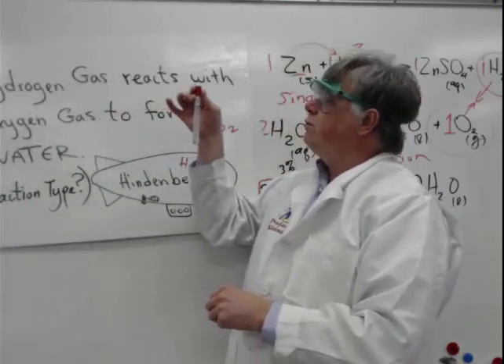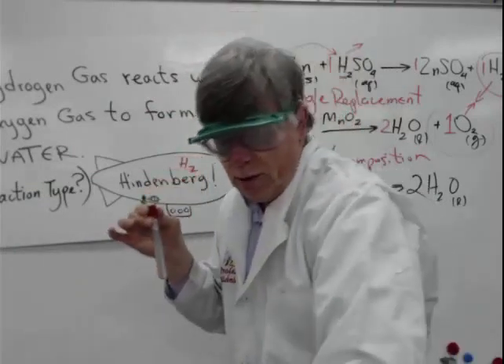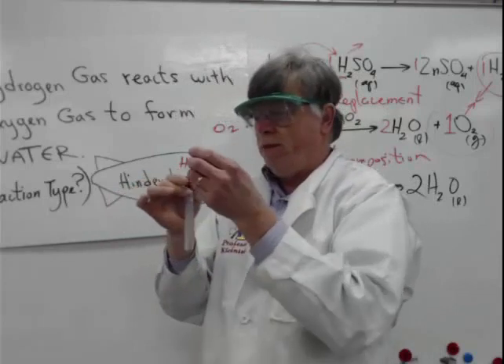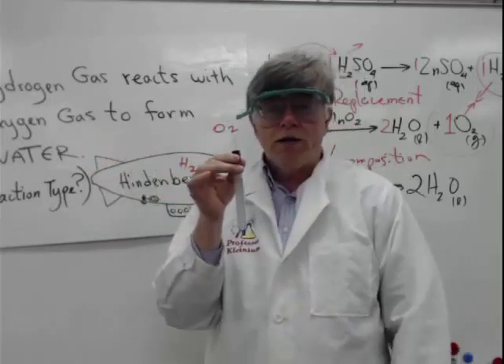So I do see some bubbles forming. Not very vigorously, but I do see some bubbles forming. Perhaps I have enough catalyst in there. Put the lid on. Okay, so now I'm ready to fill up a rocket.